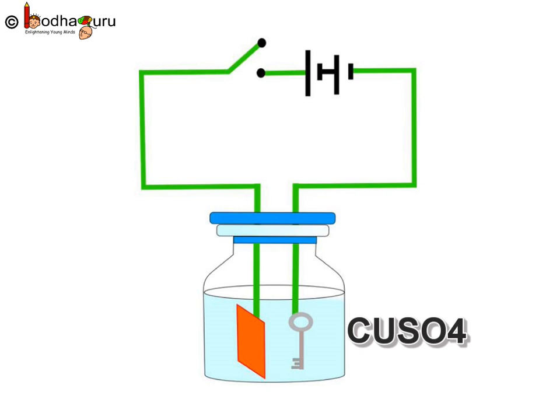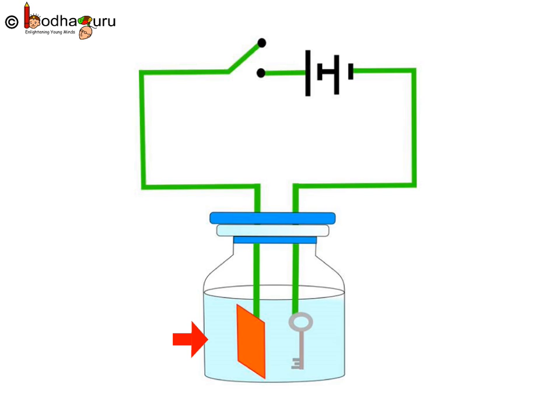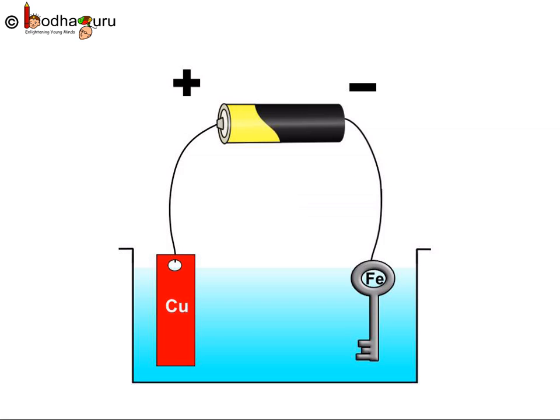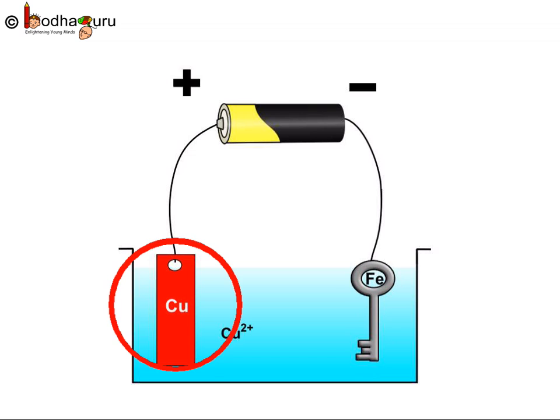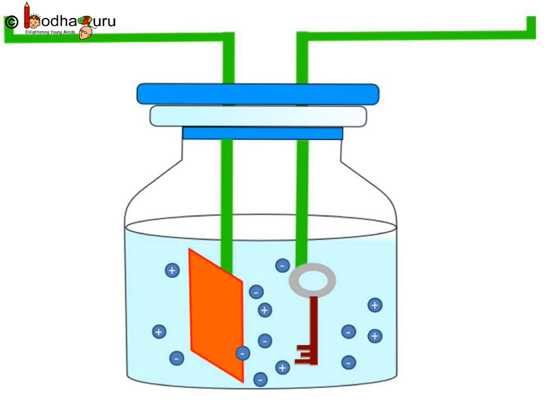Now, we connect the key to the battery using a wire, then put the key in the solution. Now, we connect the copper piece to the other end of the battery using a wire and put the copper piece in the solution. We can add a switch in the circuit instead of directly connecting the copper plate to the battery — that way we can stop the electricity flow anytime. After we start the electricity flow, copper gets deposited on the key and forms a shiny brown coating. You will also observe the copper plate starts to decay.